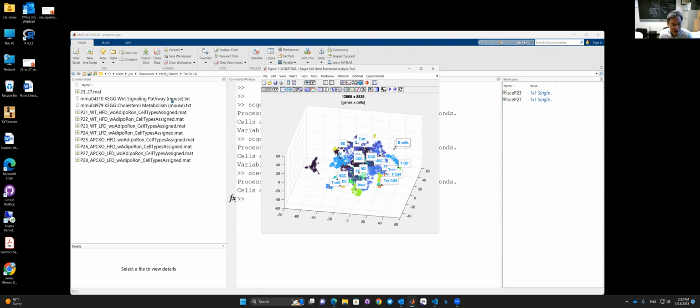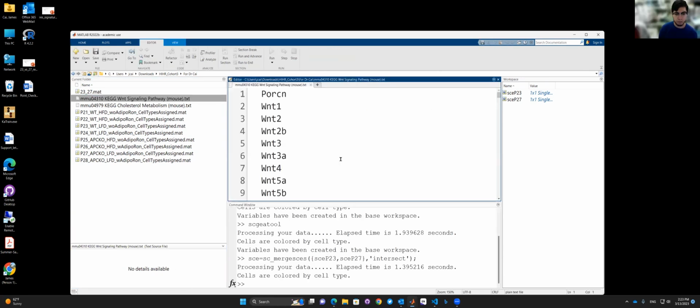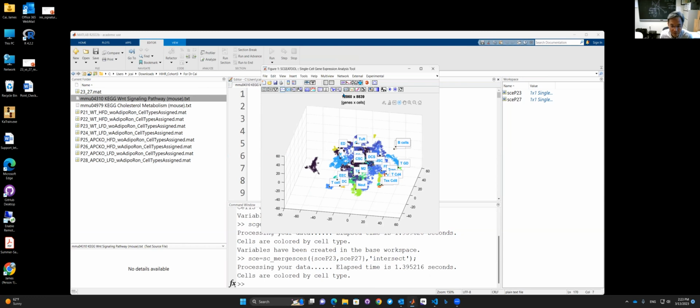You have a list of genes. So I can open this. That's the gene list you sent to me. Okay. Yeah, I copy those genes and come back to this page. Now you have a button here. It's compare between groups. Can you see that? Yes.